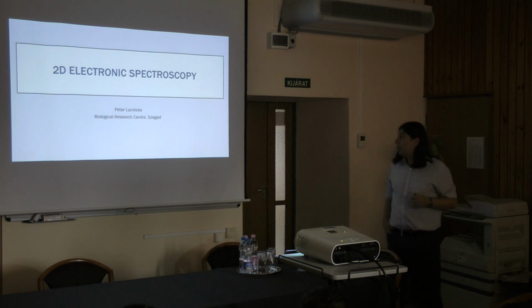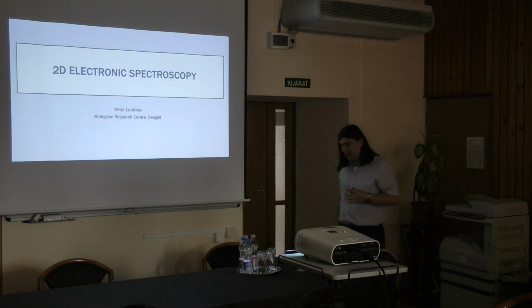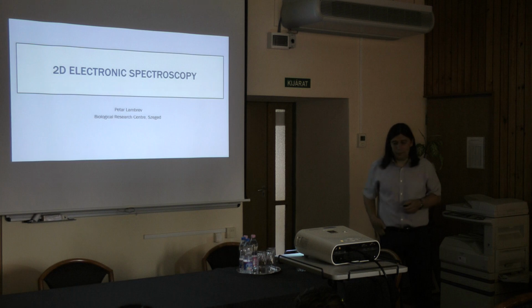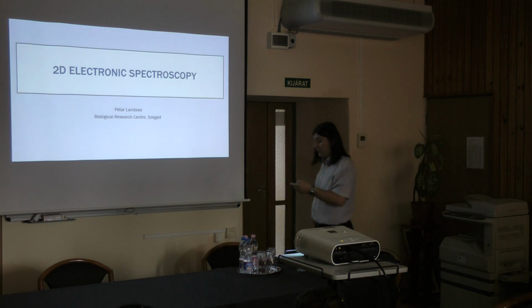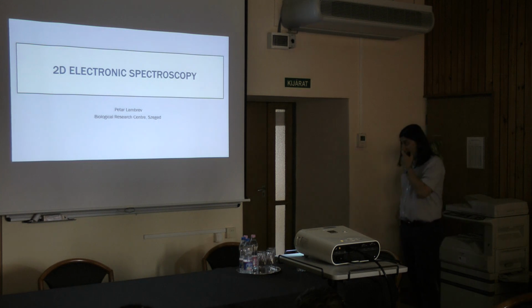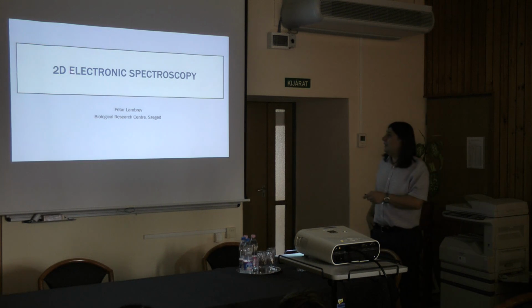what we like, let's say, we study the overall energy translocation and conversion in the photosynthetic membranes. Obviously, that needs a lot of spectroscopic analysis tools. One of those that we will talk about today is the two-dimensional electronic spectroscopy. Now, yes, this is an ultrafast spectroscopy, and electronic is just to say that we are using UV visible light to probe electronic excited states. And the key here is the 2D.